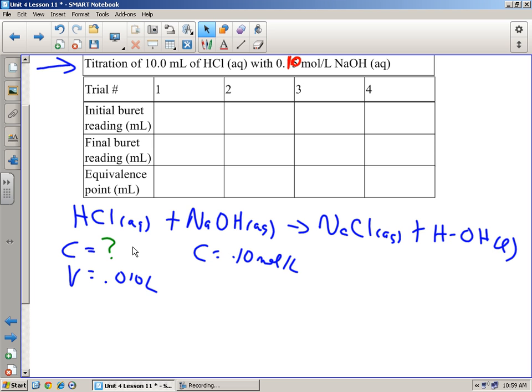Anyway, so you should get a light pink. All right? So here we go. Acid with indicator. Aliquot. Okay. Titrant with my base. Okay. Here. And you guys can come closer now. Come closer. Come here.